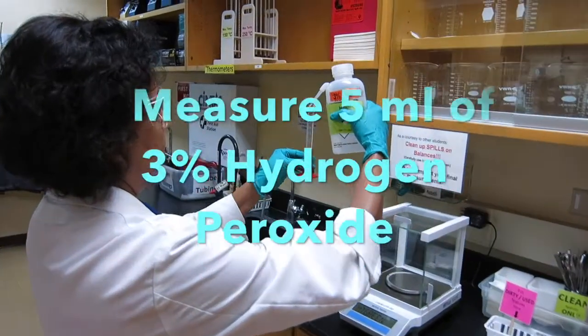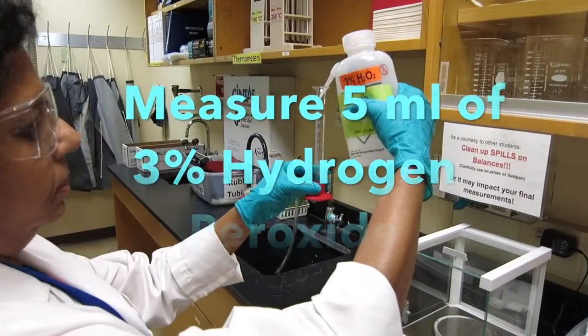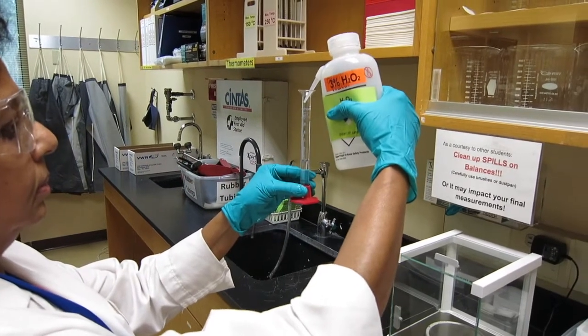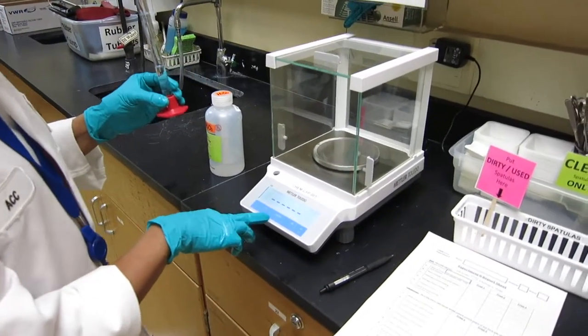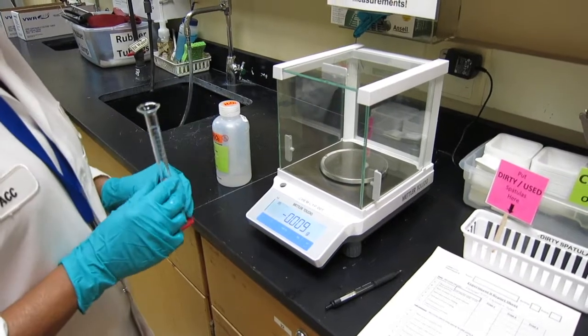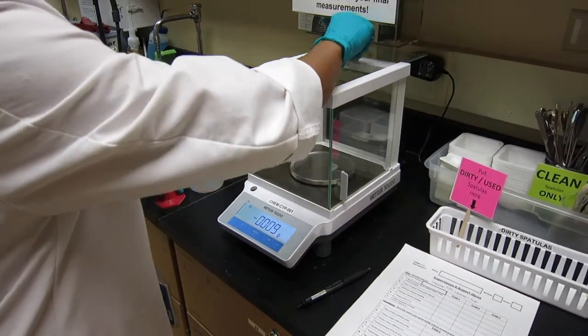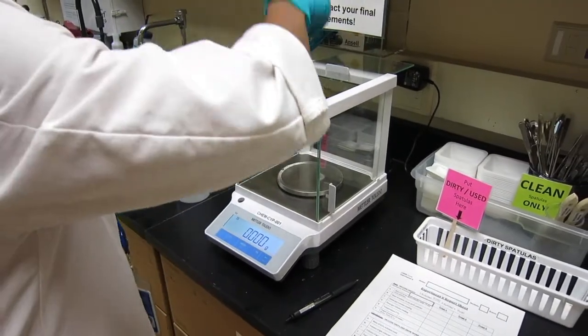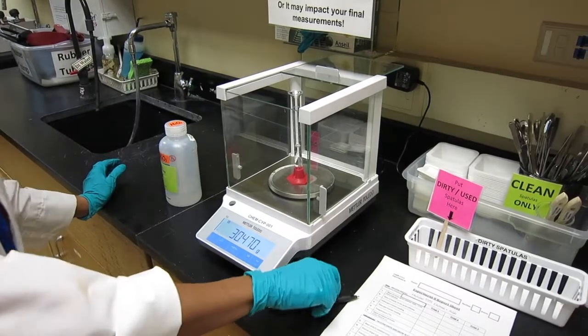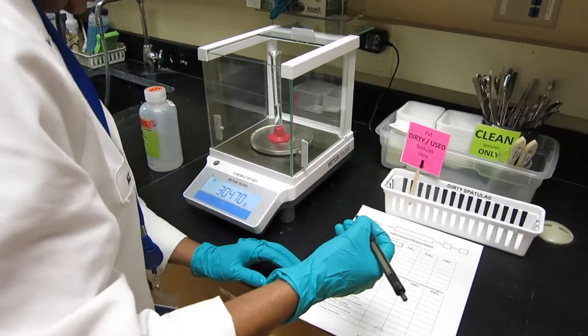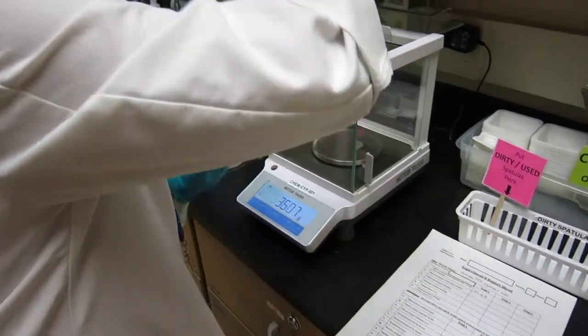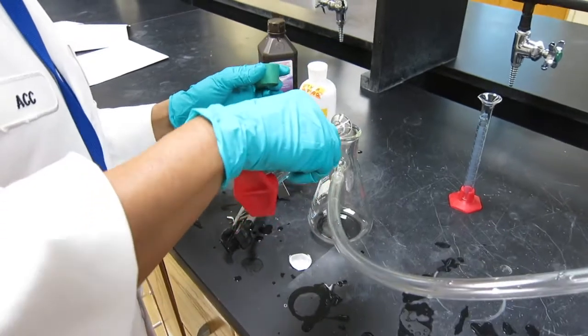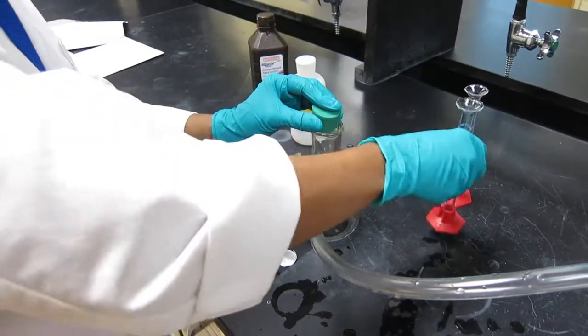So we're going to measure five milliliter of the hydrogen peroxide, the three percent. And we're going to weigh it, first tare it, zero it, and then we measure that. And then we're going to pour that into the flask and immediately cap it.